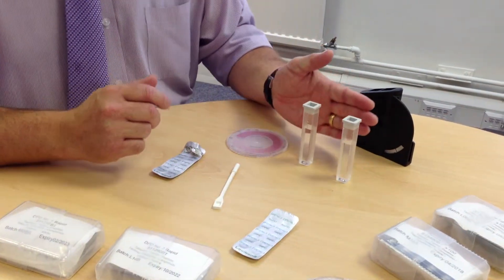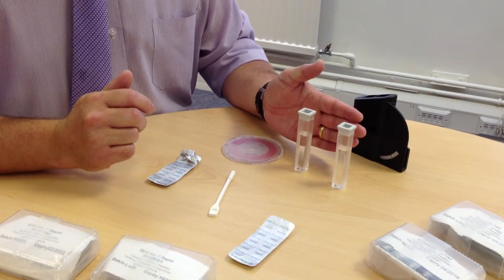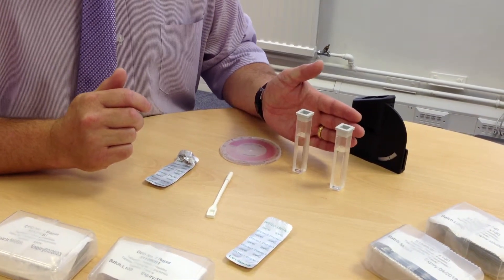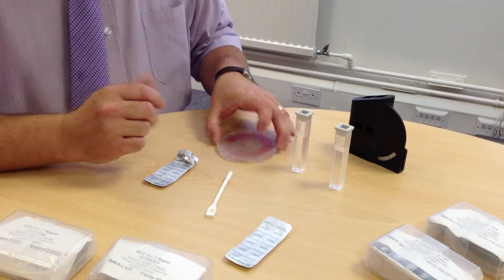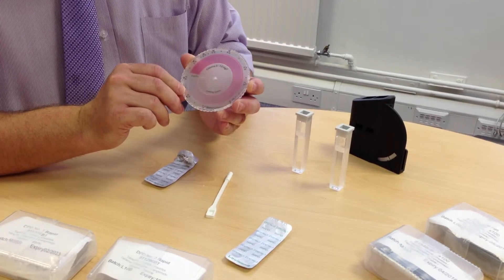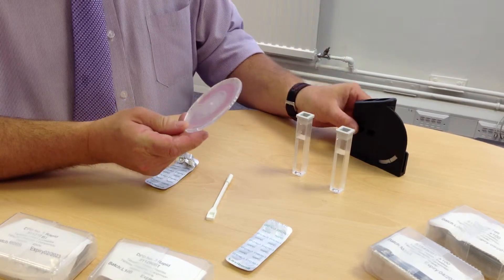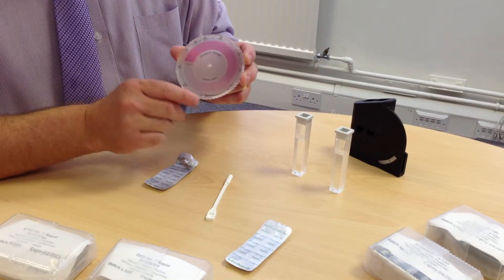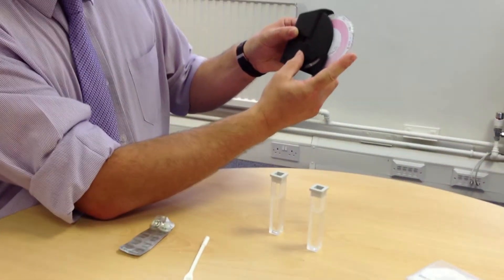We have a sample of mains water which has obviously been treated with chlorine, so the levels we are looking up to is half a ppm of chlorine. The disc itself is graduated from 0 to 1 ppm, and you need to make sure it is the right way round when it is inserted into the comparator.